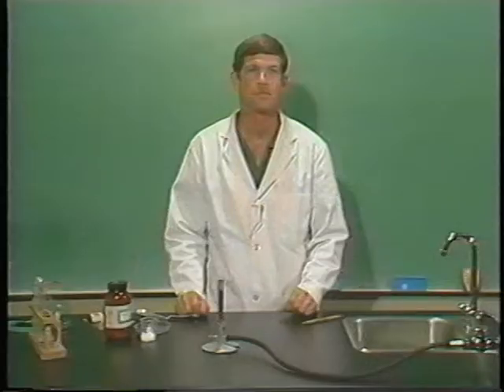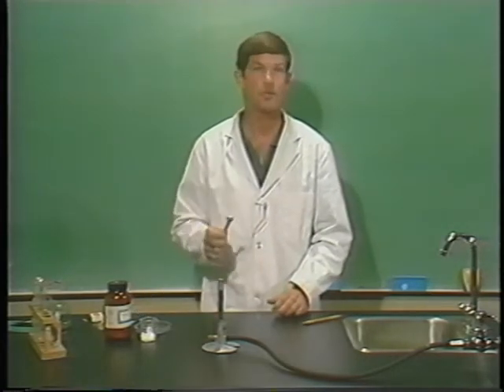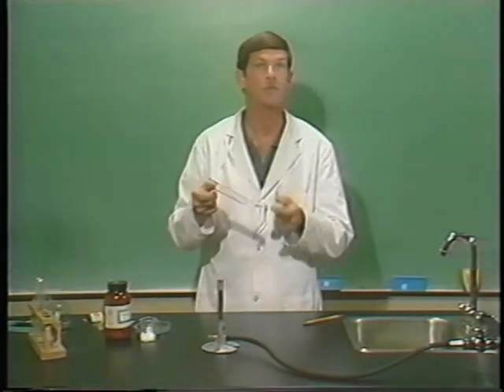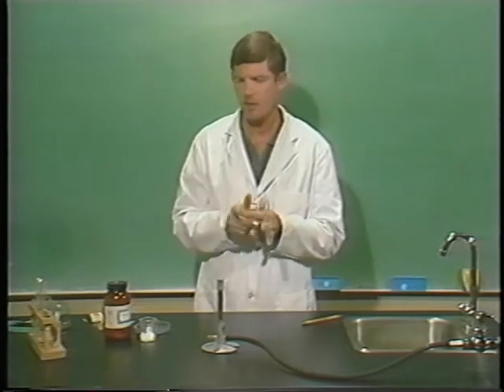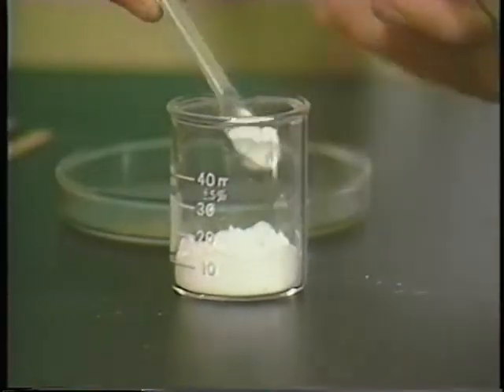So is it okay to pick this chemical up with an aluminum teaspoon and put it in a glass test tube? Yes, but we better not touch it. Now the first instruction might say, take 1/4 teaspoon of this mystery powder and put it in a very clean test tube. Why do you think we should have a very clean test tube? Well, of course, because of contaminants. There might be something organic left over from a previous experiment inside the test tube. So let's go ahead and take 1/4 teaspoon of this material and put it in our test tube.